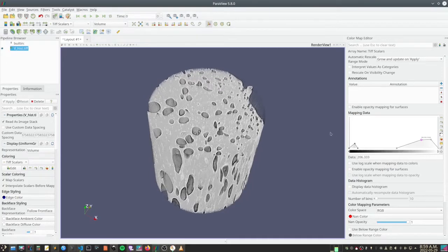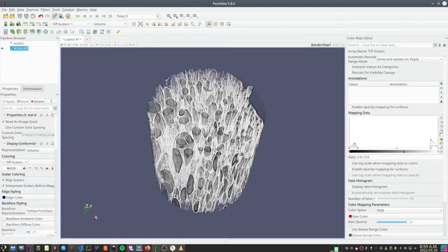And if we open it in ParaView, just playing with the opacity of the color map, we can appreciate that there are three phases essentially. There are the pores in dark, there are the fibers in white here, and in this view it's transparent, but the matrix is also present. So essentially three phases.